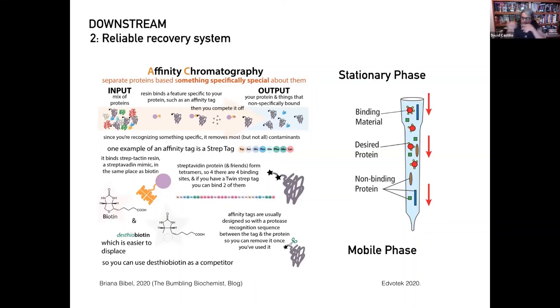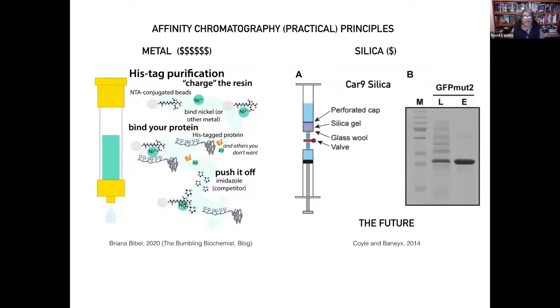So we would like to incorporate in the future that feature in which mixing a buffer, adding it, pumping it into the column, and washing several times depending on the protein that you require are going to be a key feature for different types of protein. And it will help you to calculate the buffer conditions, for example, if you need to increase the pH or lower the salinity or whatever, depending on your protein's biochemical features. So yes, this is more or less the presentation of what we have been working on as a side project as well.